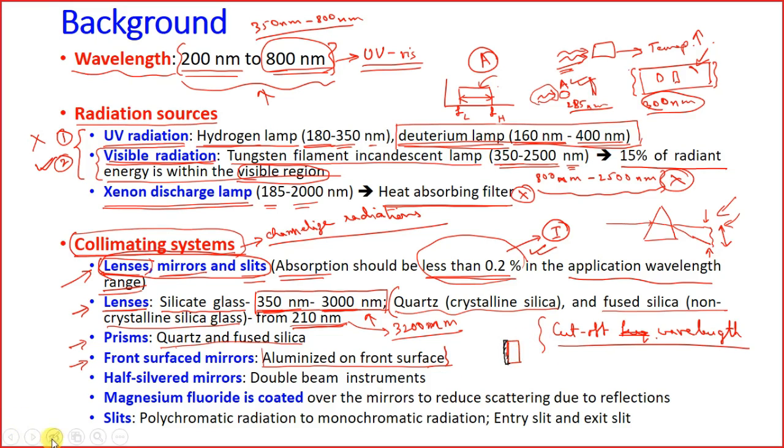So initially the rays go through the glass, fall on the aluminum sheet, and from there get reflected. But there are certain problems. When you are passing through the glass, as your friend told, there can be refraction. Also, the glass may absorb some energy, so some energy will also be lost.